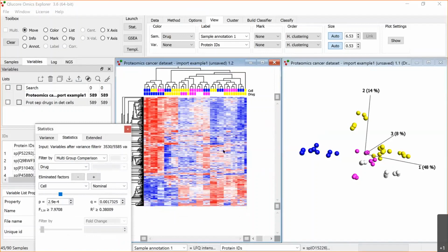So that was a quick example analysis of this proteomic dataset. So I think I had a question, so let's have a look at this. Okay, so somebody's having problem with the audio. I have one question here.